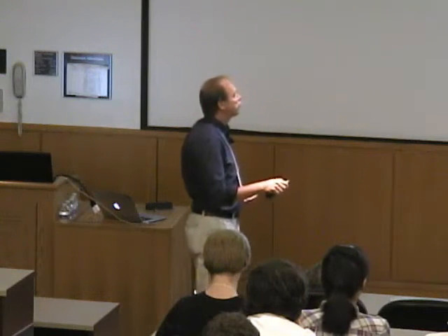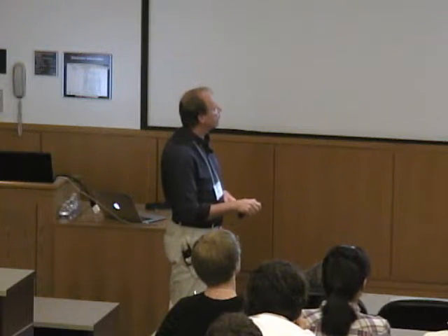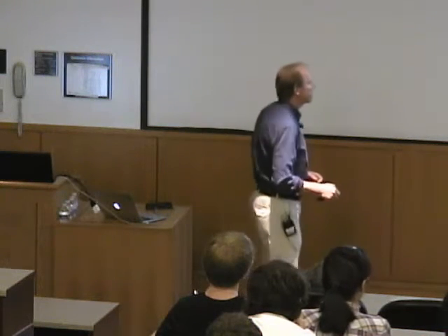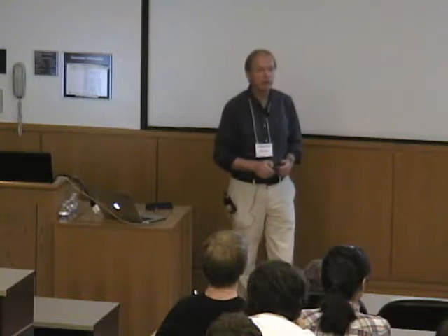For a spin 3/2, the ±1/2 levels will be degenerate, and the ±3/2 levels will be degenerate, but they will be split from one another by this zero field splitting. And this has a huge impact on EPR spectra. There's a really fundamental difference between systems with spin equals 1/2 versus ones where it's greater than 1/2.